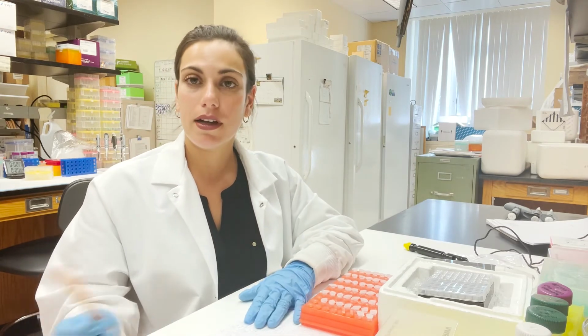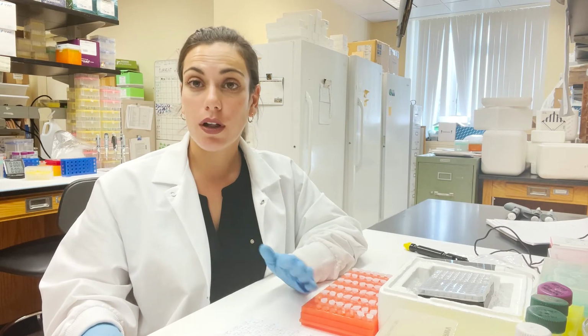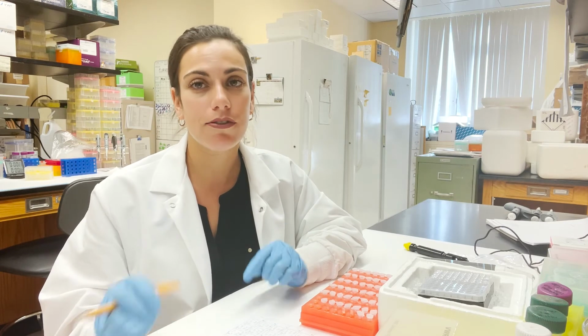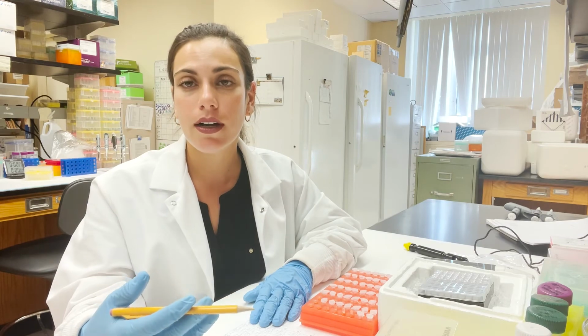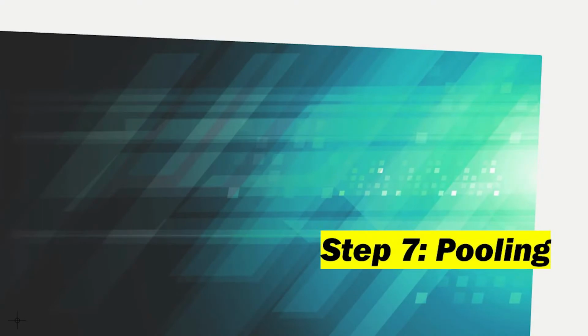Okay, so now I have the concentration of all of my samples, and they look pretty good. Almost all of them are between 6 nanograms per microliter and 12 nanograms per microliter, except for 6. So those 6 samples I will have to redo the pipeline for, and then at the end I'll pool those instead of the ones on this original plate. So that brings us to the end of the pipeline for one plate. However, because my population is over 200 samples and we're only working with 48 samples at a time, I'll have to repeat this at least 4 more times, not including any of the redos.